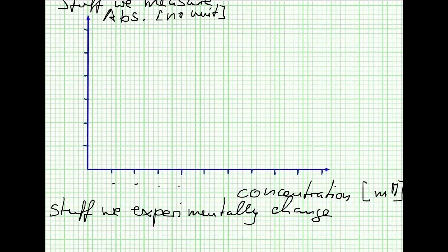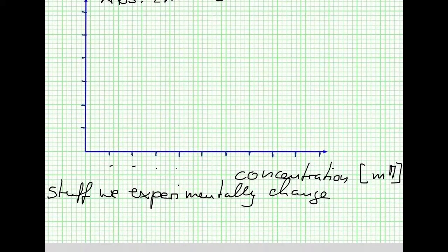So I want to have my last number, that should be the largest. So here I've got, let's say, 5, 10, 15, 20, 25, 30. Well, the way I've drawn it, let's do that 40 here. Let's do that 50. Yeah? So I would go 5, 10, 15, 20, 25, 30. I would probably in my graph go up to here.